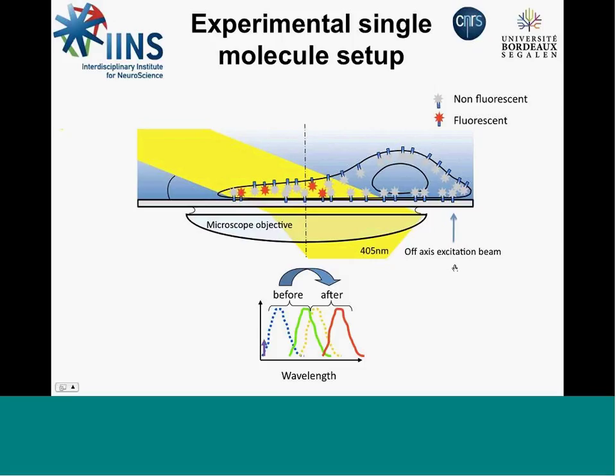So this technique is certainly one of the most popular of all the super-resolution techniques because it only requires a very basic microscope. Use any nice, say, TIRF technique, where you can go from TIRF to oblique illumination, then you have a system which is compatible with this localization-based super-resolution microscopy. It doesn't require any fancy or very complex instrumentation. So you take a good standard microscope, and you use either photoactivatable proteins or the dSTORM effect, and then you will be able to achieve super-resolution. That's why this technique is certainly the most popular amongst all the super-resolution techniques.